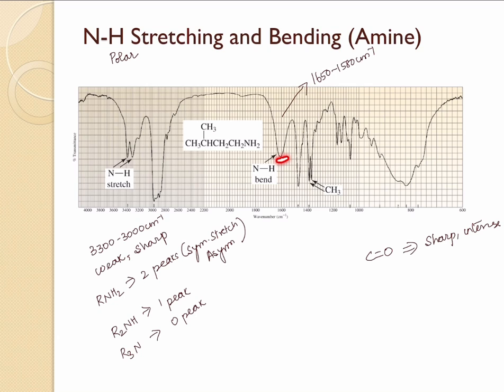And this NH bend is only present in the primary amine. It's not going to be present in the secondary amine or the tertiary amines.